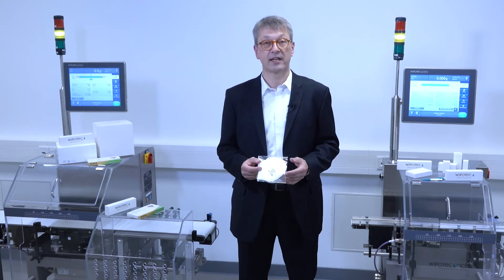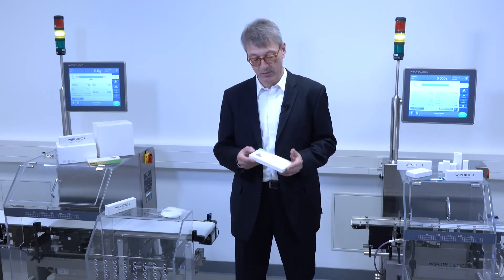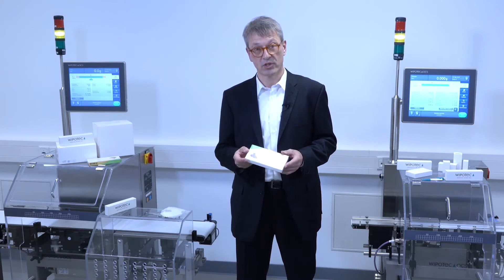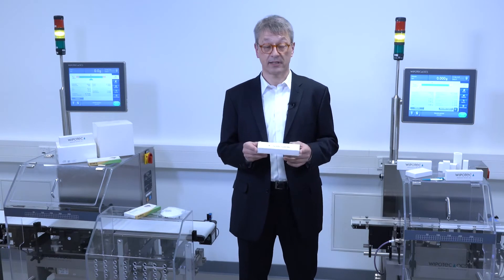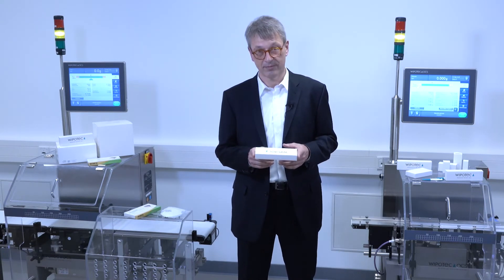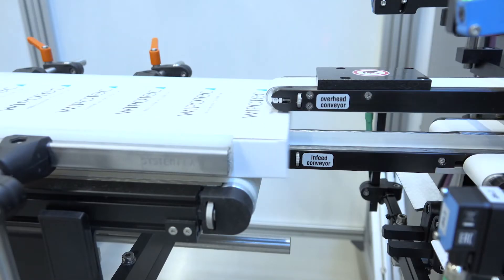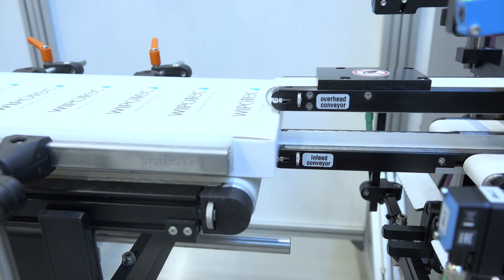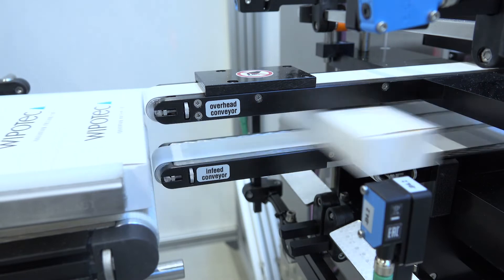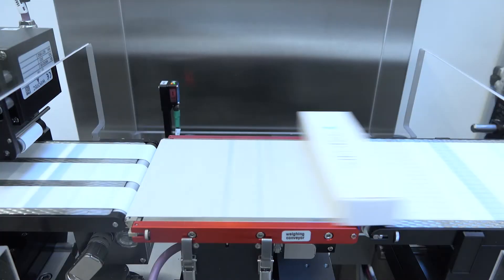Speaking about pharmaceutical and solid products, we also handle things like masks or medical devices — quite common at the moment — those for testing, and those which come in cartons, typically with a 200-millimeter-wide conveyor. Using those things, cartons bring the product and feed into the checkweigher with a side grip conveyor. A top-bottom conveyor is very helpful, taking over the product in a guided way and keeping the orientation of the product perfect.